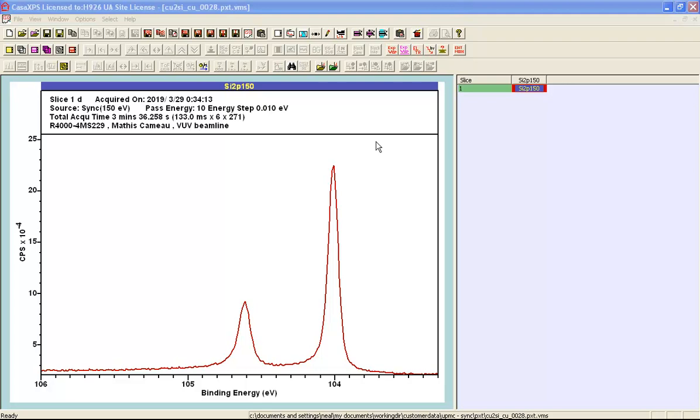There are other parameters within the PXT file that are useful when displaying data and understanding the data. In this case, the experimental variable that has been defined for this VAMAS file is indicated as a slice, and the term slice in the context of the Scienta Omicron data indicates the way the data have been collected from the multi-channel detector.